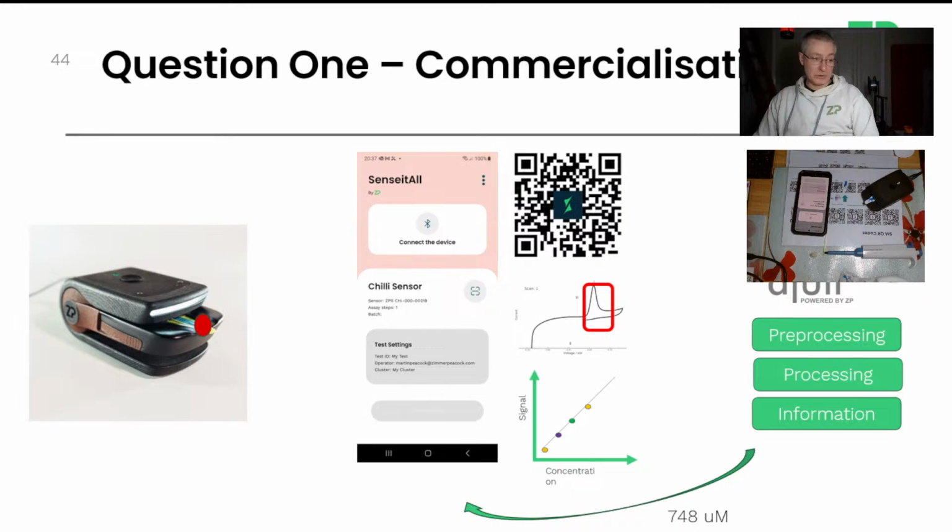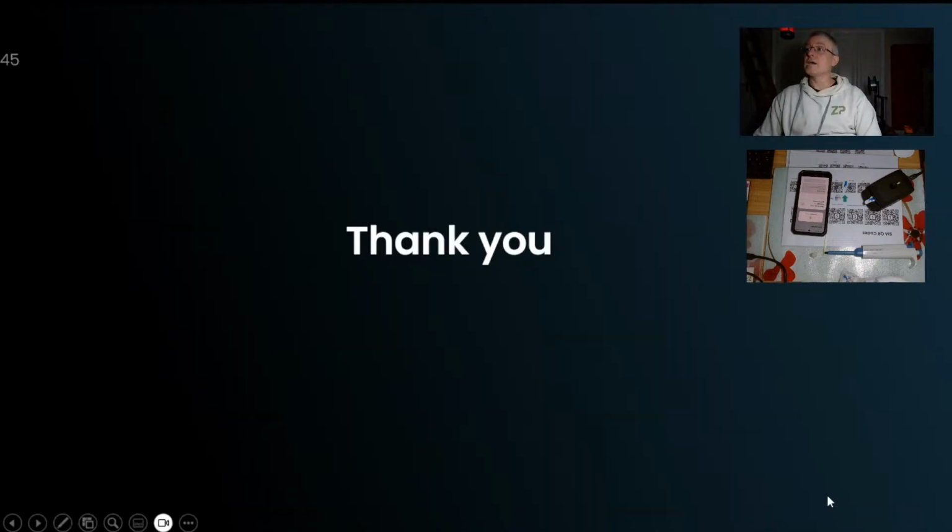Have I proven reproducibility in this particular webinar? Yeah, go back and look at question number 2, because there I was defending in a good way our electrode because somebody was having problems, and I genuinely said, no, honestly, our screen-printed electrodes are really good. They are using a different potentiostat with different connectors. They are using our screen-printed electrodes. So I do ask people to use our instruments because then it's easy for me to support the instruments.